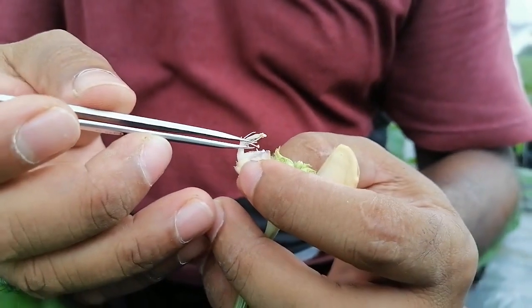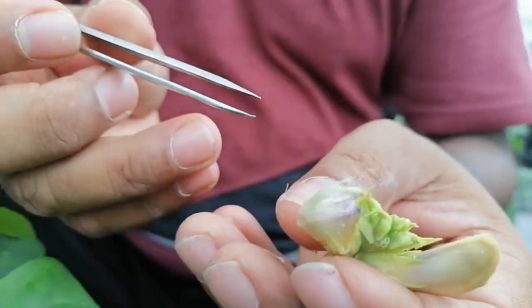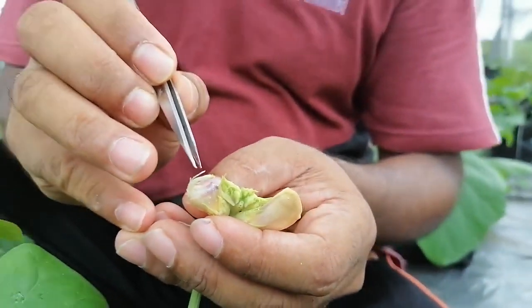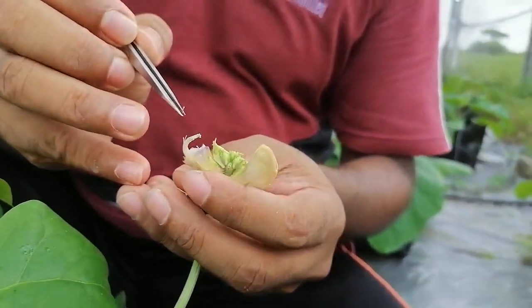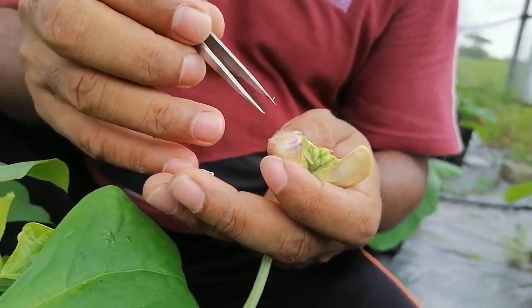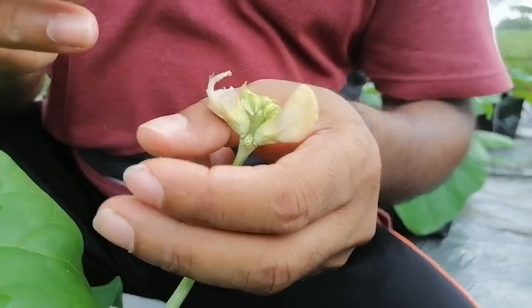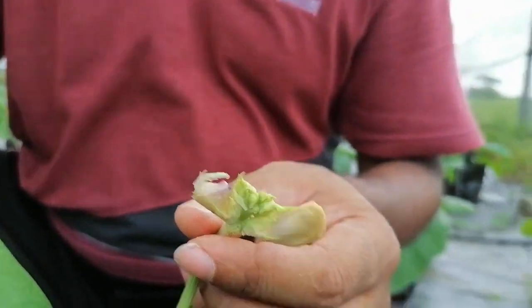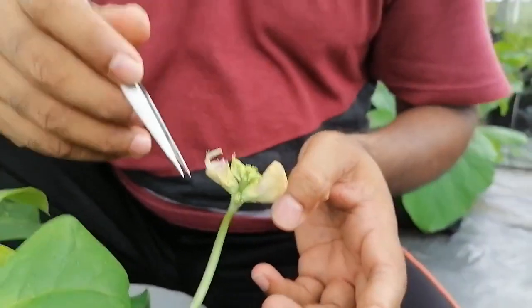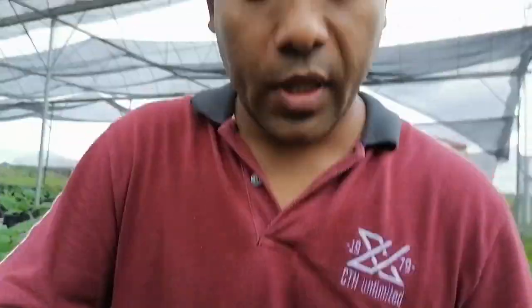All anthers have now been removed. You can see only the stigma remains — the lobe at the top of the stigma looks green while all others are whitish, and they are sticky. This is the stigma. The emasculation is now complete. After emasculation, bag it using a breeding bag, paper bag, or any suitable bag you have available.